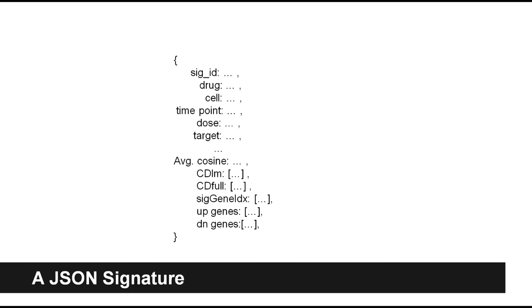If the cell line, perturbation, and time point are the same, they should be the same experiment, just different batches, but replicates. But I thought the signatures should aggregate different batches of experiments.